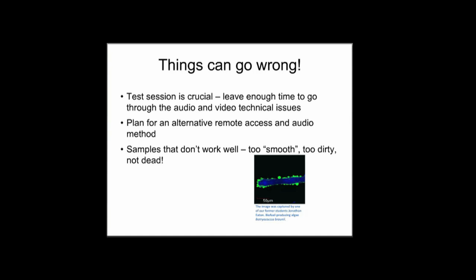And lastly, samples that don't work well: if it's too smooth and it's the same composition throughout, it doesn't really look as great on something like a scanning electron microscope. Also, if you're collecting samples, if it's too dirty, like has a lot of dirt, unless you want to look at the dirt, sometimes that may not go too well.